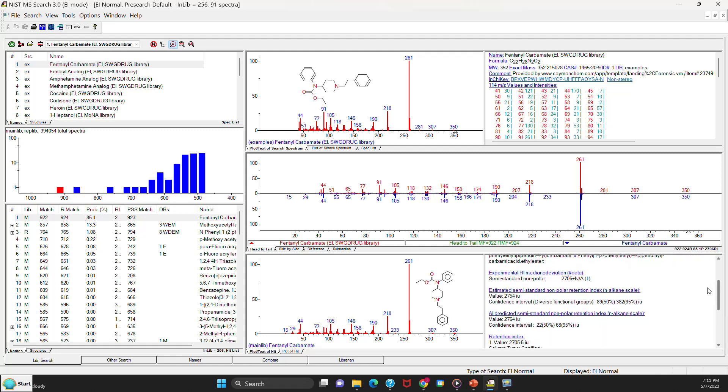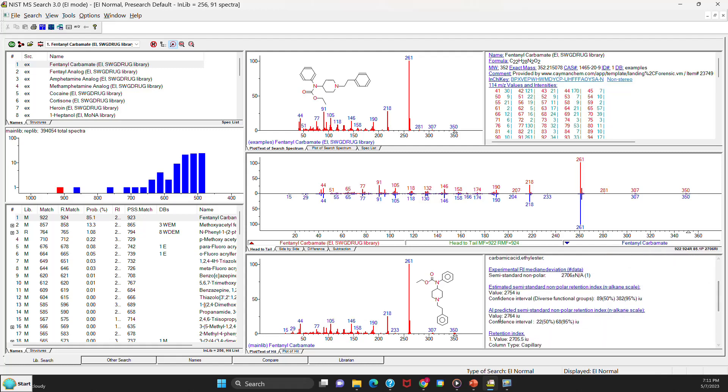Another thing that has been added is this artificial intelligence RI retention index. And they calculate these with a new computer program that's very much more representative of the compounds that they found by looking at things that they know. They found it's just a better way to estimate the RI for compounds. So that's been added for everything in the library because it doesn't really require this compound be run at NIST. They just calculated it for all the compounds. So you might find that useful in your work.